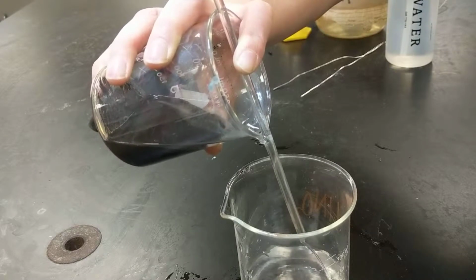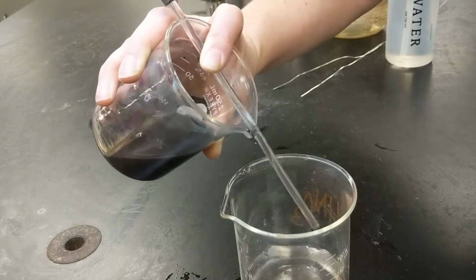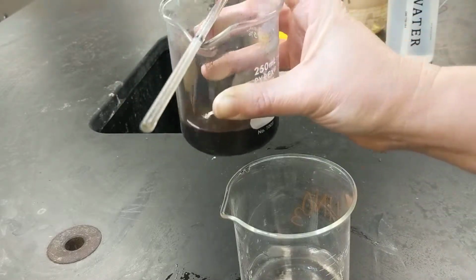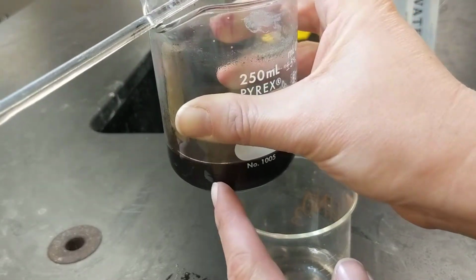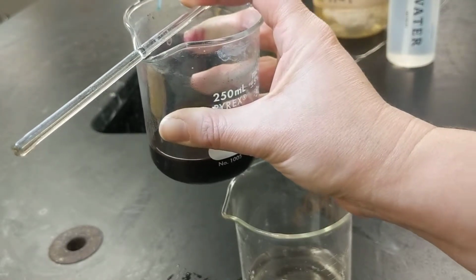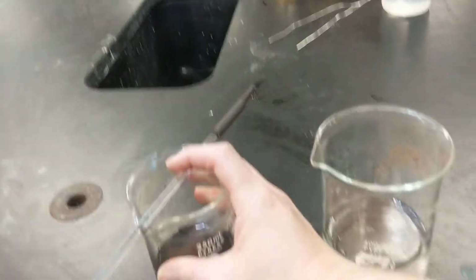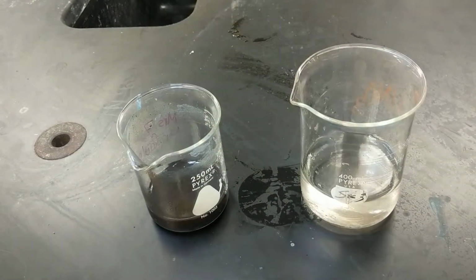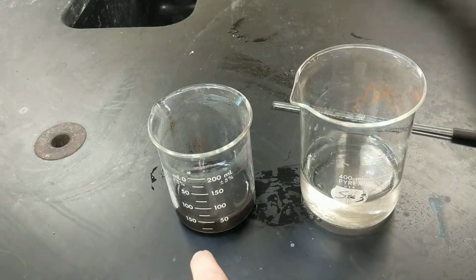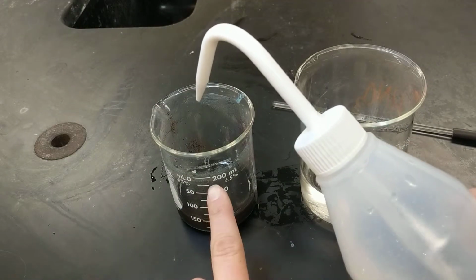See the solid starting to come closer to my stir rod. And you can see it started to come off there. Okay, we don't have to decant all of it right away. If I look, I can see that I still have some water in the bottom. Now our next step tells us that we're going to wash our solid. That's step 7. So I'm going to add in 100 milliliters of water, and it's just approximate. I see that I'm at about 50 milliliters here, so I'm going to take my wash bottle and add in water until it's at about the 150 mark.